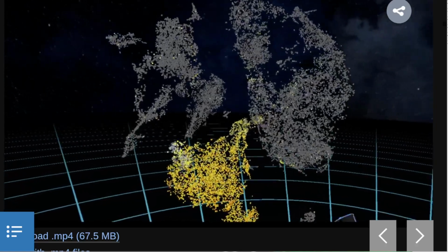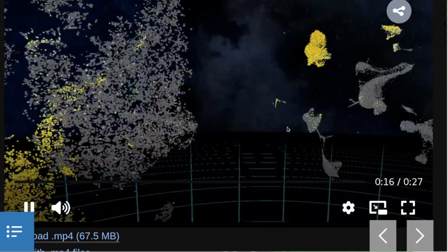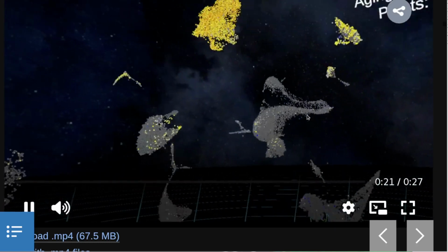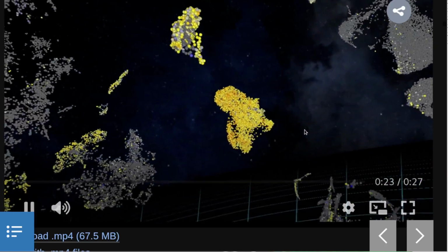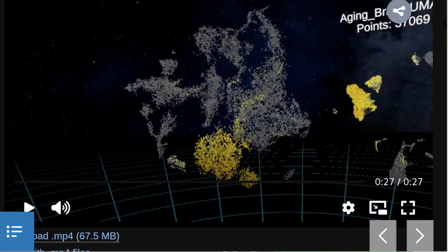Genes are searched for by using the virtual keyboard that queries a SQL database of genes and their expression values. When confirmed, all DR plots in the environment are colored according to expression. Heat map expression colors can be changed using the desktop configuration menu.